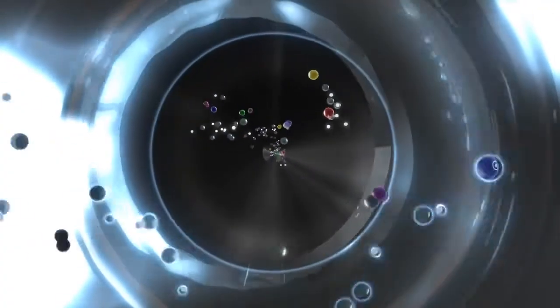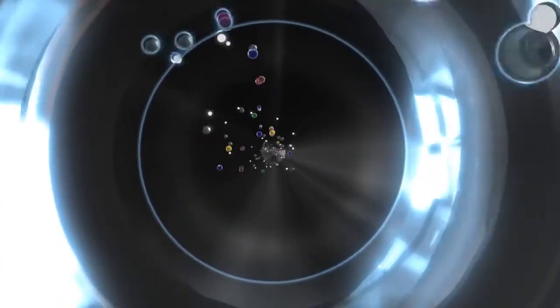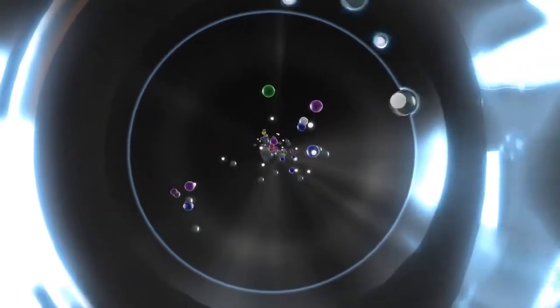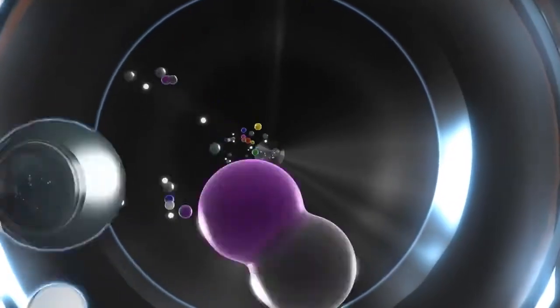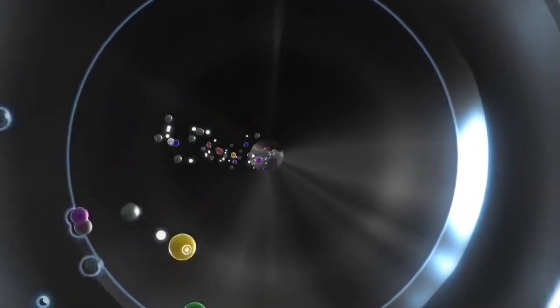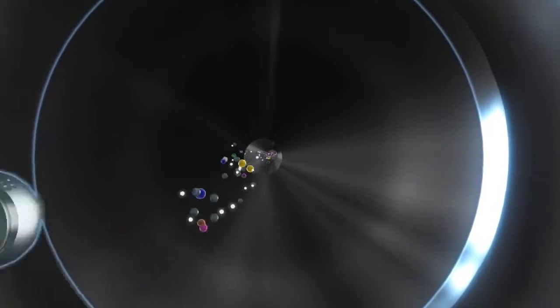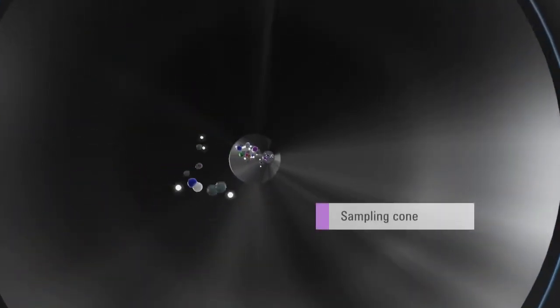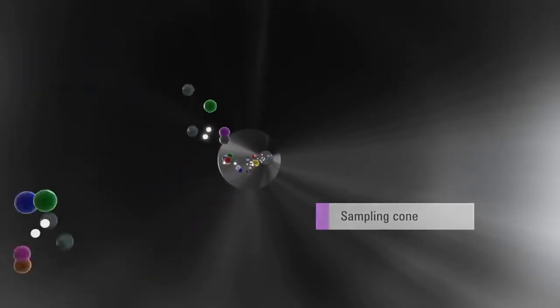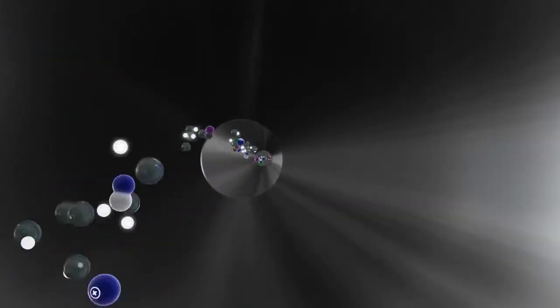The ions generated in the plasma are extracted into the high vacuum region through the two interface cones. The unique design of the 7700 interface combines exceptional matrix tolerance and high sensitivity across the mass range. The interface cones are O-ring free and both are held in place using thread mounts, so no screws need to be removed for routine maintenance.